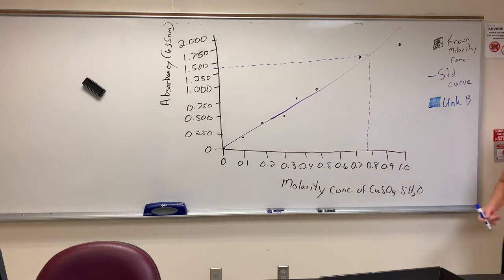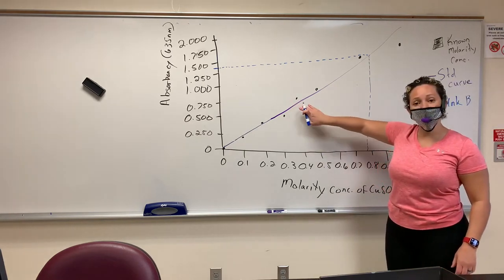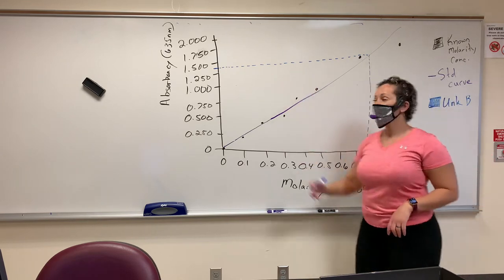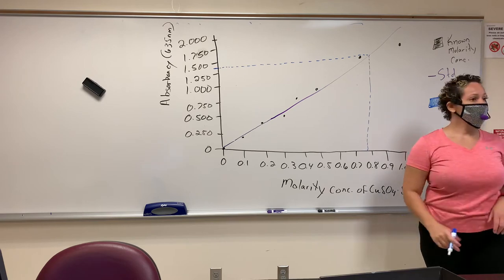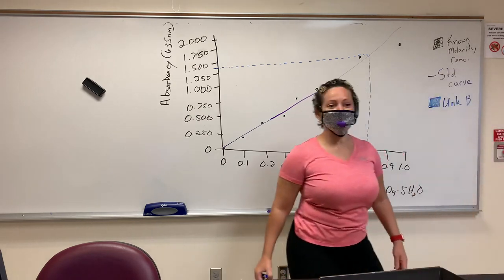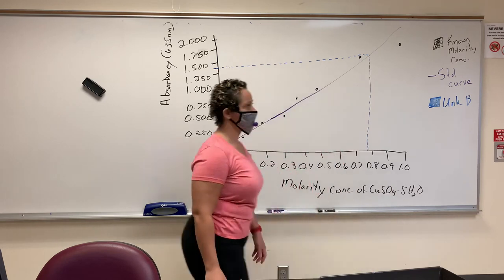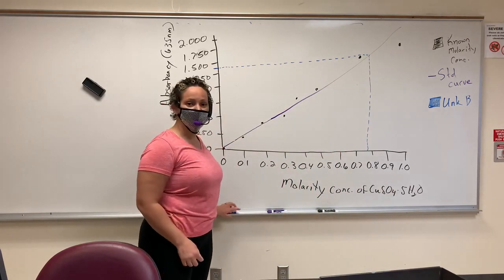So to repeat, we have used known data to establish a standard curve. That way we can guesstimate unknown data. And you'll do that for all 3 of your unknowns. Plot them on there. All right, that's it. Oh, that's not it. I saw you shake your head, so I was like, yeah, we're it. What is my graph missing? Title. Exactly. Because it means nothing without a title.